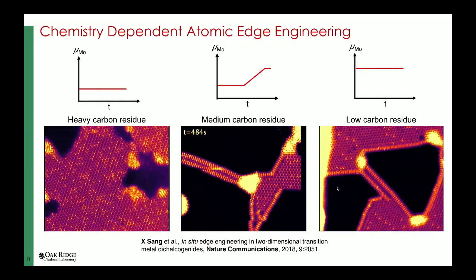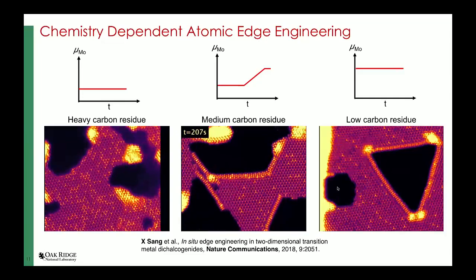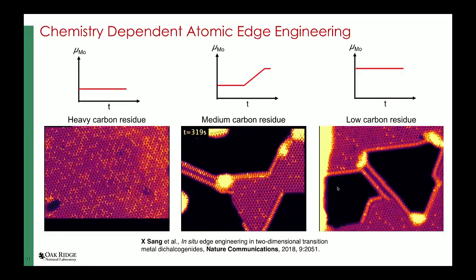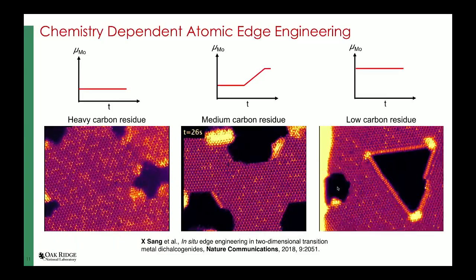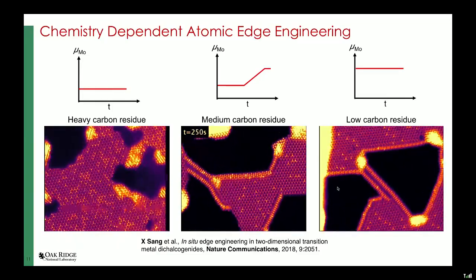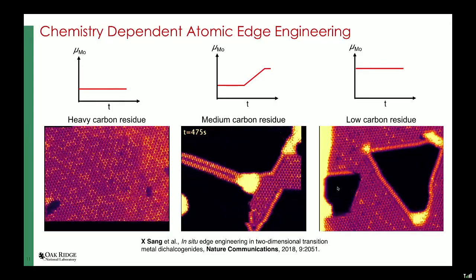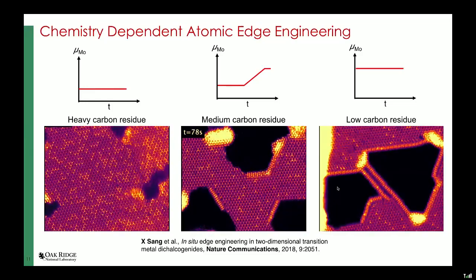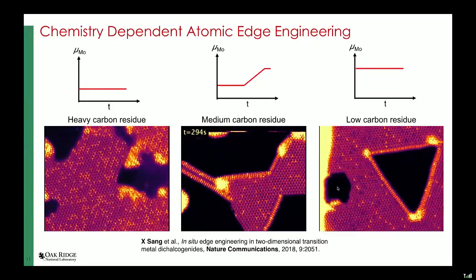And so for people that do electron microscopy and study transition metal dichalcogenides, boron nitride, or graphene, it's pretty ubiquitous that you'd have a lot of contamination on the surface. I like to turn that from a negative to a positive by saying, if we have a little bit of carbon residue, or if we can intentionally modify the structure of these materials and heat it up, we can form some really interesting new nanowire or functional nanomaterials.